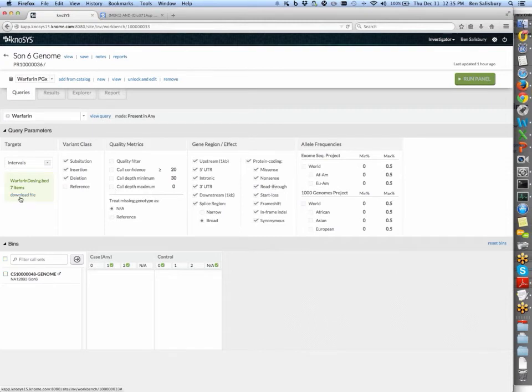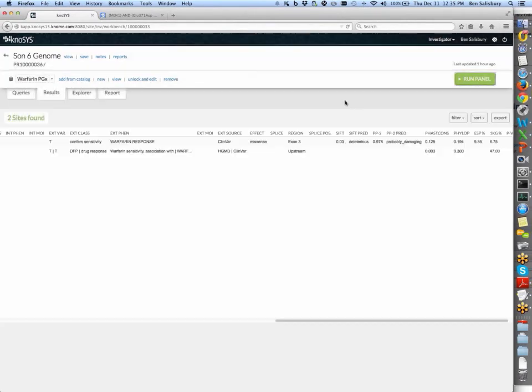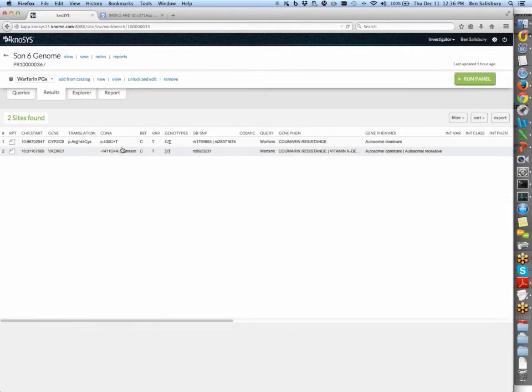And effectively, I turned off all these filters. I just want to see whatever is found in this genome. When I mark him as a case and run the panel, it searches across the genome and very quickly finds the things of interest. And in fact, a couple sites come out that have these external records of relationship to warfarin response or sensitivity. And these are the 2 most common variants of concern: the CYP2C9 star 2 allele and this VKORC1 promoter variant.